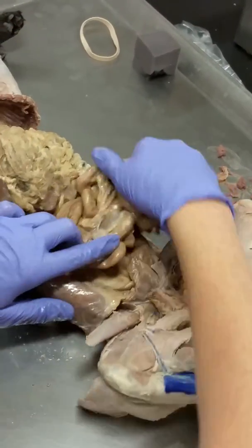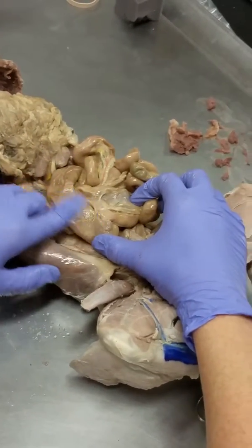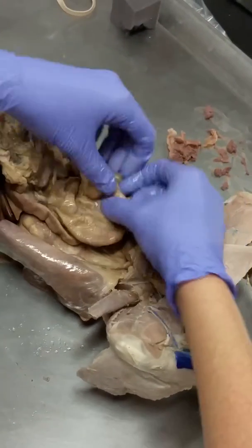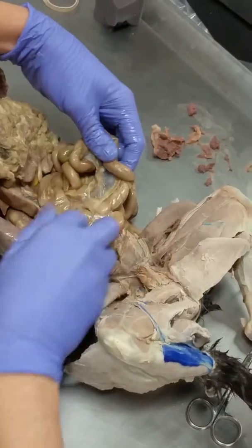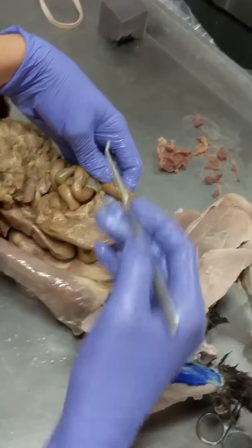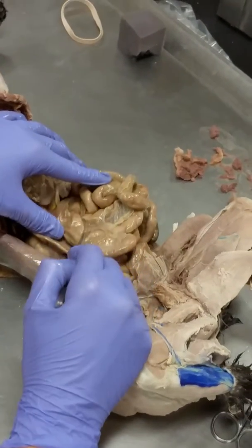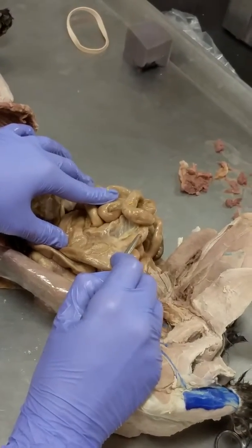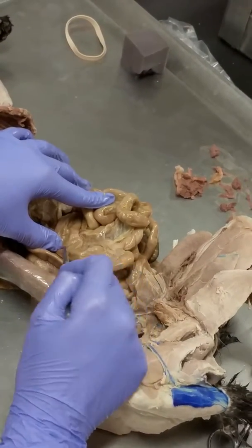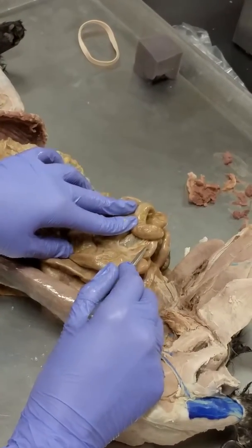So for ileum, if I'm going to pin the ileum, I'll make it so that you can see, can you see here where there's large intestine right there, and there's small intestine right here. If I want to pin ileum, I'm going to pin it right here, where you can see both large intestine and small intestine, because the ileum is the part of the small intestine that connects us to large intestine. So if I pin ileum, I'm going to pin it right there.